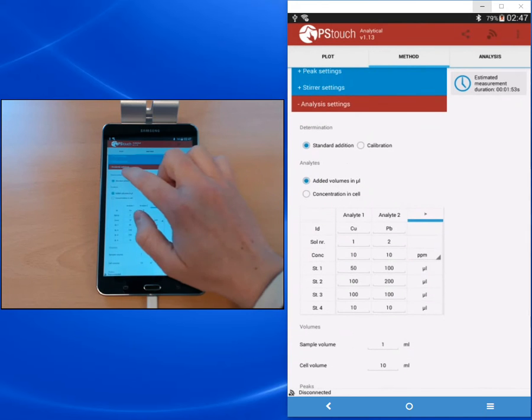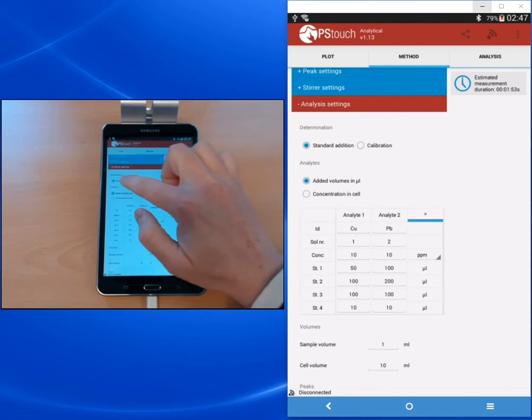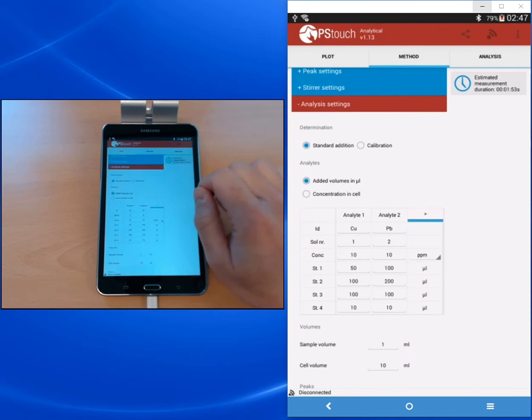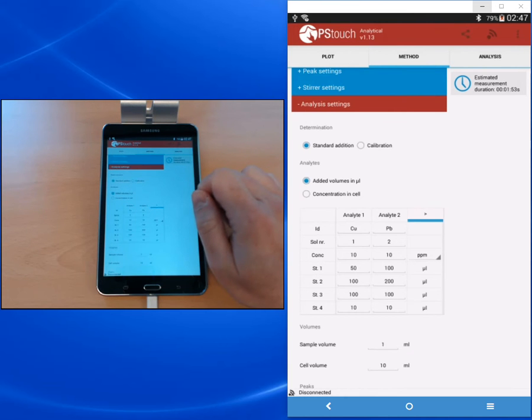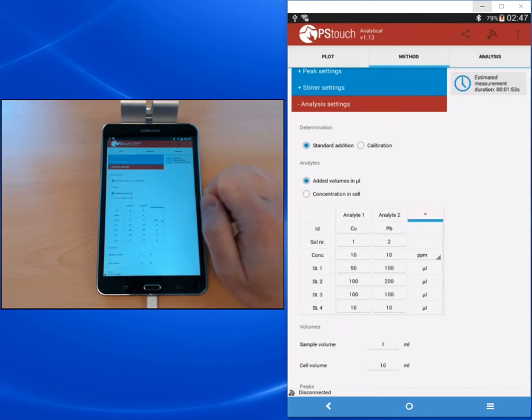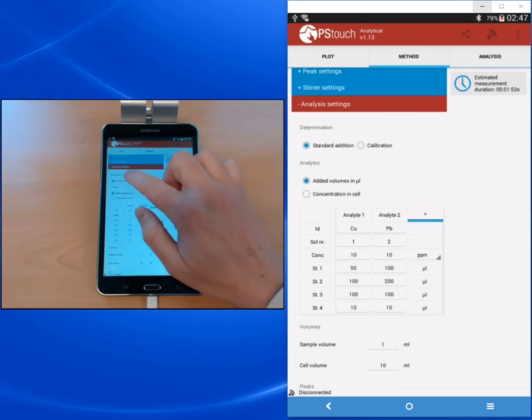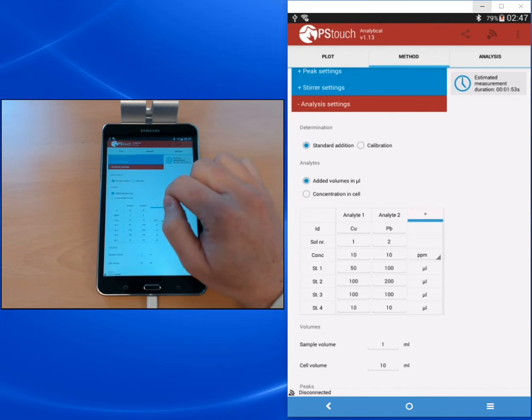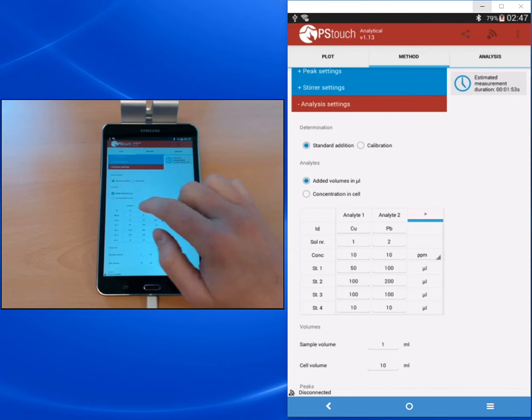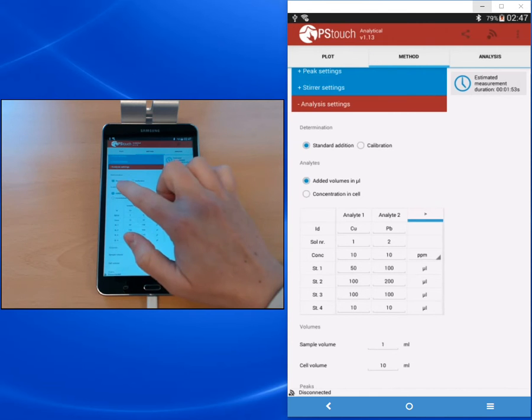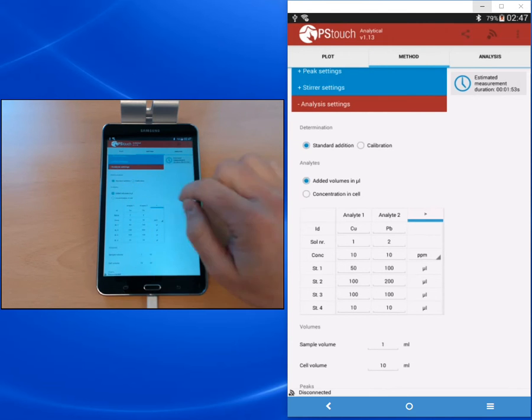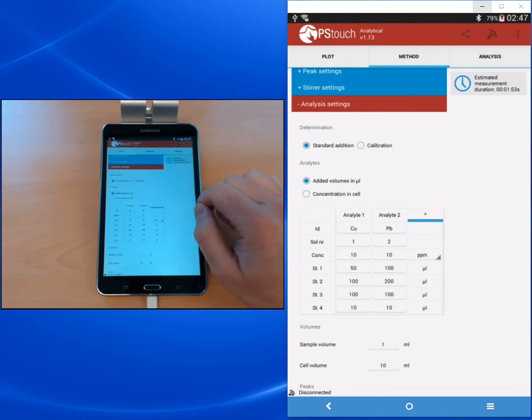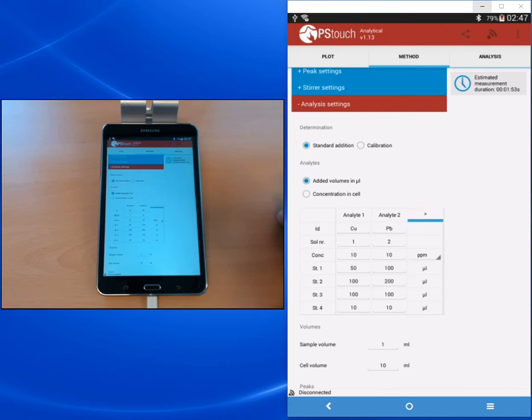On the top you see the determination part where you can choose if you want to do a standard addition or a calibration curve. As mentioned before, usually a standard addition is done when you think components might interfere with your sensitivity, and a calibration is often done when you have a lot of samples that you want to measure after you have determined your calibration curve.